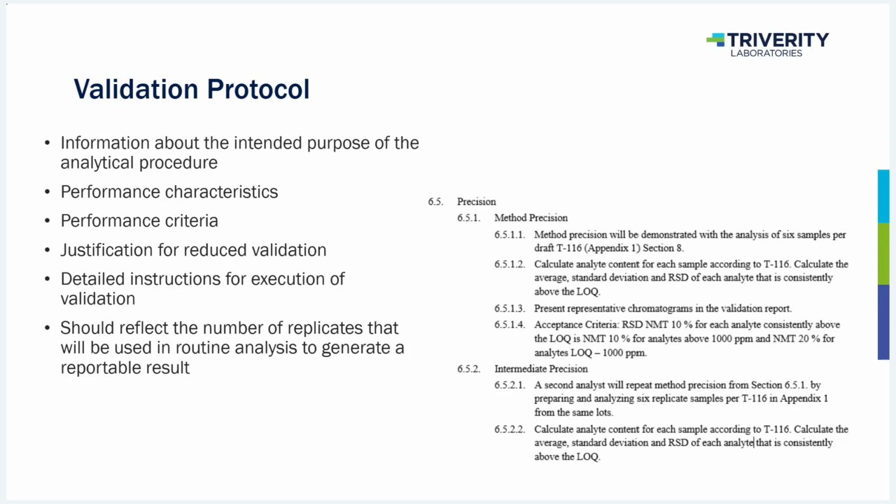And then in our validation report, we'll actually re-report all of that, because we like to have a validation report that is comprehensive. You don't want to have to provide a report to a regulatory body for your drug product and then also for your drug substance. If you didn't need to, you probably would anyway, but it's better to have all of the information in the same place. And then we want to have detailed instructions for the execution of the validation.